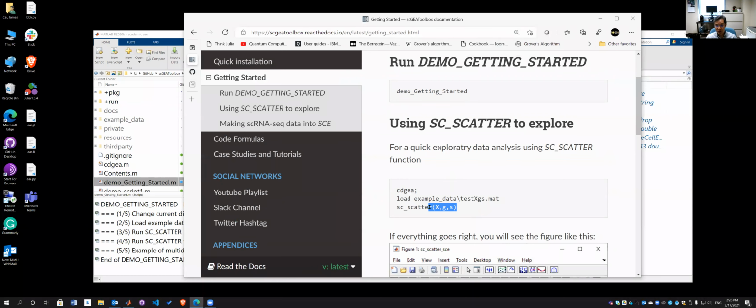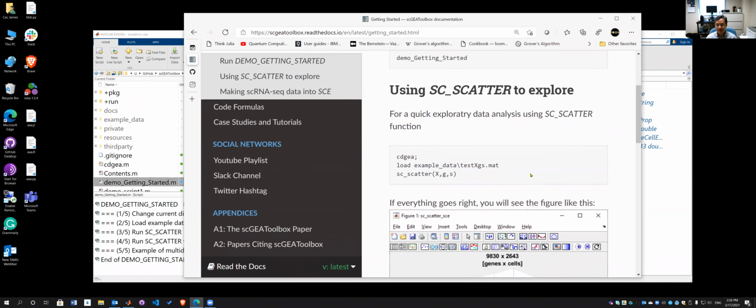If you don't, let me know. Why does this scatter plot need 2 or 3 variables? What do the variables mean here? Can anyone explain this to me so I know you understand? Does it need 3 variables for each of the 3 axes, so X, Y, and Z for that 3D feature?